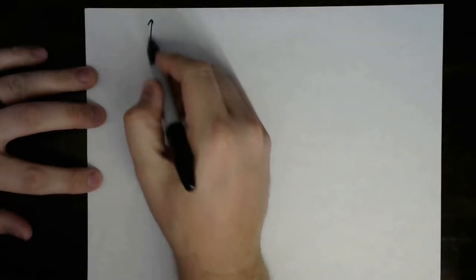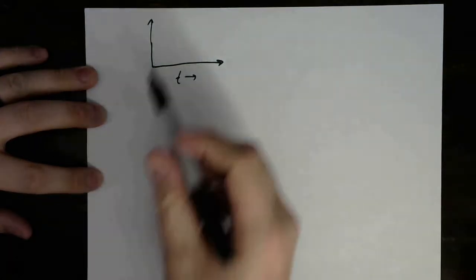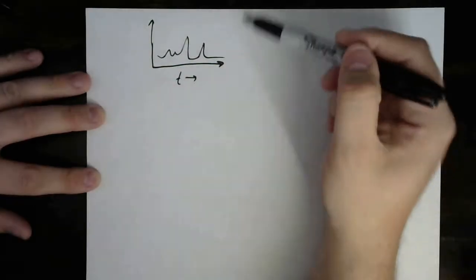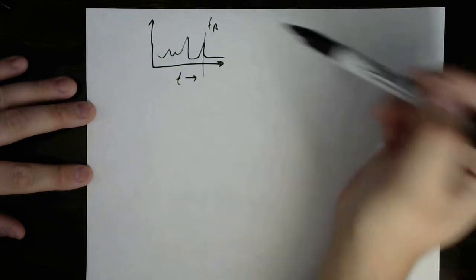So let's think of a mathematical way to discuss, or at least a quantitative way to discuss, this concept of total inclusion, total exclusion, and resolution in size exclusion chromatography. It starts with a concept we've used over and over again, but I'm going to remind you of it right now. Our x-axis here is time, and we get chromatographic peaks. We are used to thinking about these in terms of their retention time, T sub r.